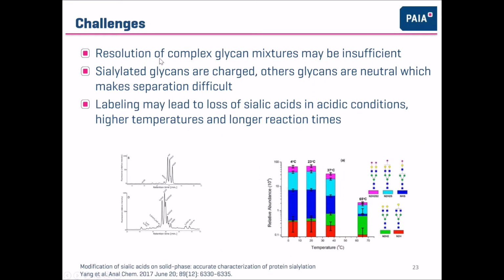So in all, what you end up having is quite a challenging situation, because the glycan mixes, especially with high degrees of sialylation, are hard to resolve with chromatography, for example. And the sialylated glycans are charged as opposed to other glycans which are neutral, and that's just making the separation even more difficult.